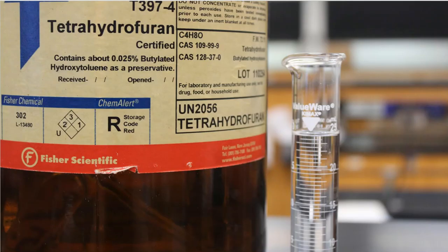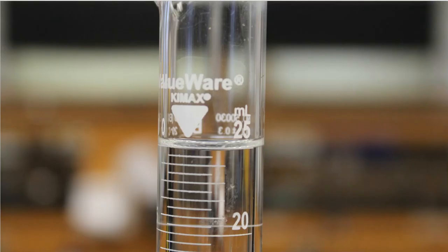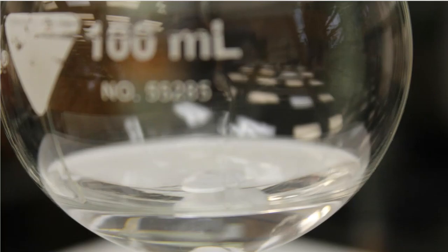All right, so the directions now tell me to go back to my THF. So I go back to this bottle, and it says pour out 25 milliliters. All right, and that's what I did. You can see that in the graduated cylinder over here to the right. The meniscus is at the 25 mL mark. If you don't believe me, I'll zoom in. There you go. Then I'm going to pour that 25 milliliters into this round bottom flask that has my 1-hexene in it. So this is 1-hexene plus my THF mixed together.